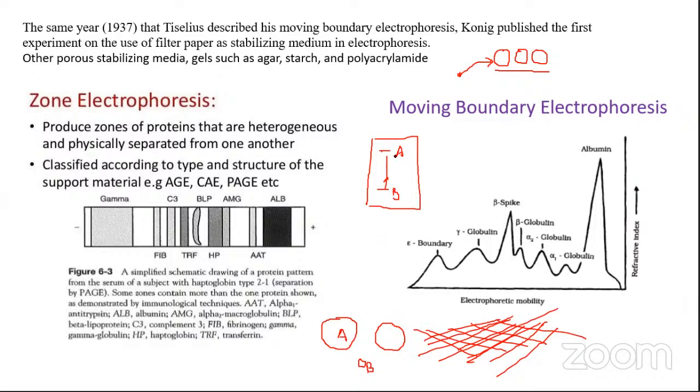Is this much fine? So A will be kept stationary at one point while B can start to diffuse once you stop electrophoresis. There are methods by which you can stop this process as well once the electrophoretic procedure is done. But this will take time. This is not a very fast process to happen. Am I making sense? Yes? Are you getting the point I'm trying to refer to?